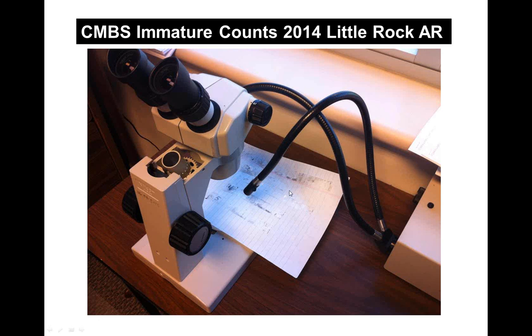In the sheet with the 5 tapes on it. Yes. That's essentially the technical device we use to count. And we'll go from here. One of the things I want to point out, you see the ruled paper, the lines on the paper, that helped quite a bit when there were a lot of crawlers on the tape, because you could count discrete areas.